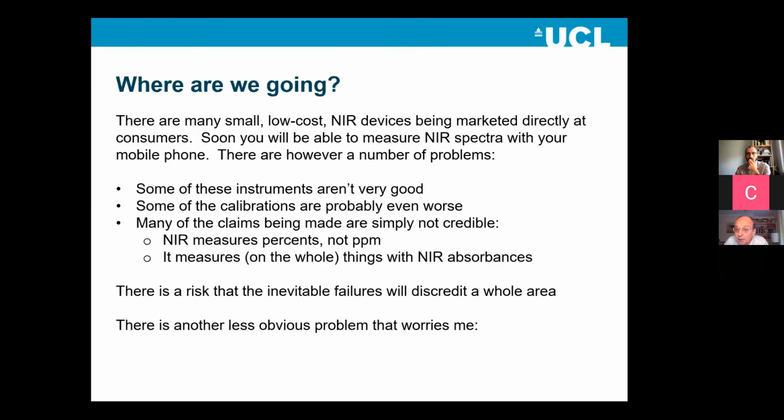My experience is that some other portable instruments and their spectra are not very stable or reproducible, even minute to minute, without temperature control. Yeah, I agree. I think stability, and in particular temperature stability, are the problems that these instruments have. If you're going to make the thing very small, there isn't room for sophisticated temperature control. And if you don't have sophisticated temperature control, and especially if you're using it all over the place, then you may get instability.